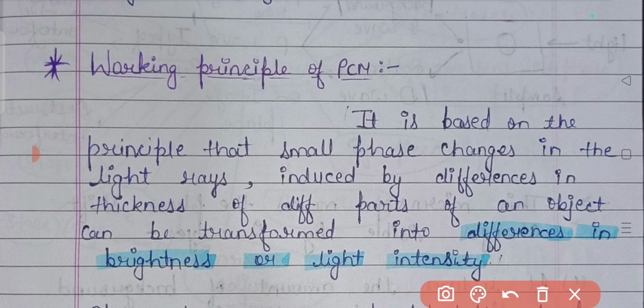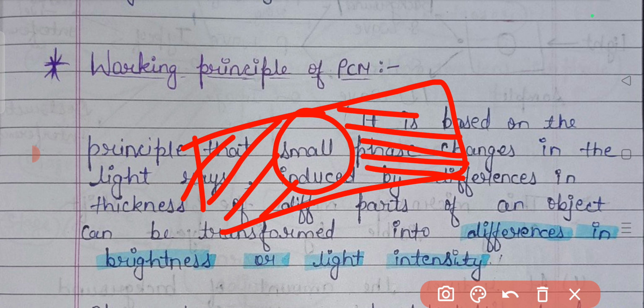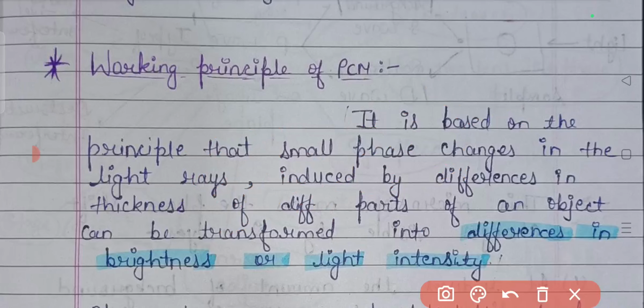Next came the dark field microscope. In the dark field microscope, we cover the background part and make it dark so that no background light will be observed, only the specimen wave, or the scattered light of the sample. As a result, a clear image will be obtained, but again not as clear as with the bright field microscope, so it has some disadvantage. So here comes the phase contrast microscope.